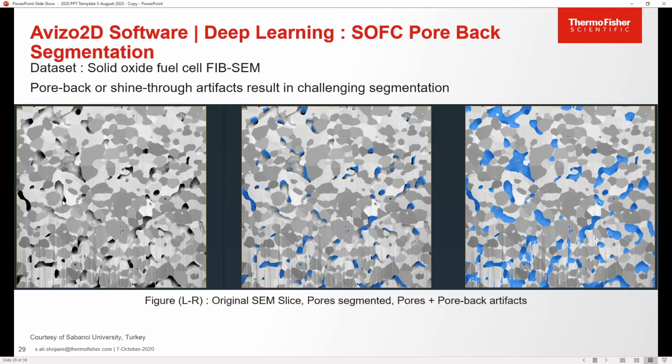I look at it, I know it's a pore, but the grayscale value inside of it is the same because the layers below it are going to be visible. So here, it should actually be dark, but because we can see the layers behind it, it appears to look like this. This is going to be such a difficult job to segment out this region. To differentiate between this using the conventional ways of doing segmentation is going to be such a big headache. That is where deep learning and artificial intelligence is going to come in.